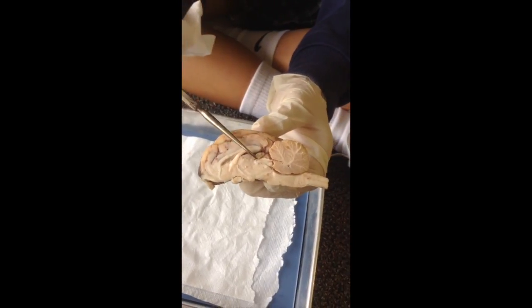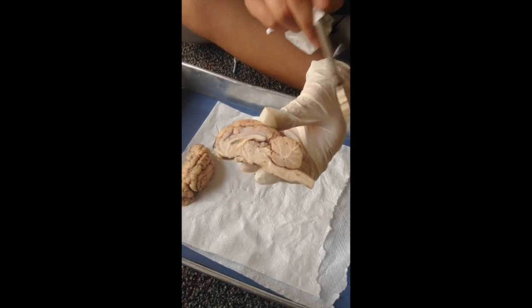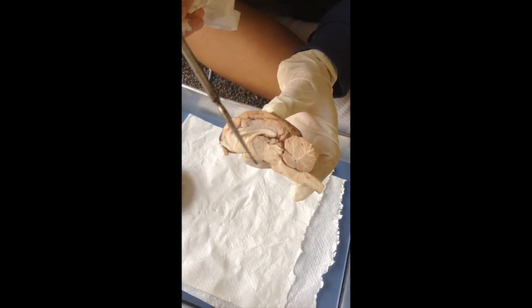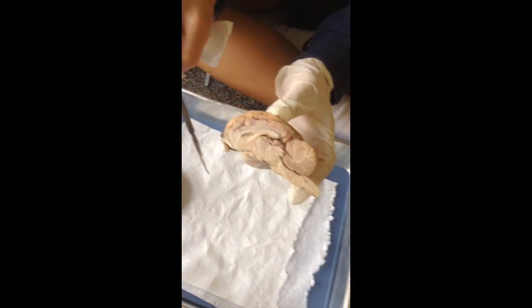The pineal gland produces serotonin and melatonin. Spinal cord sends information to and from the brain. The pituitary gland would be down below, and it secretes and controls hormones.